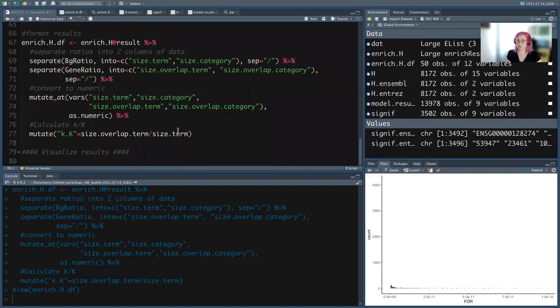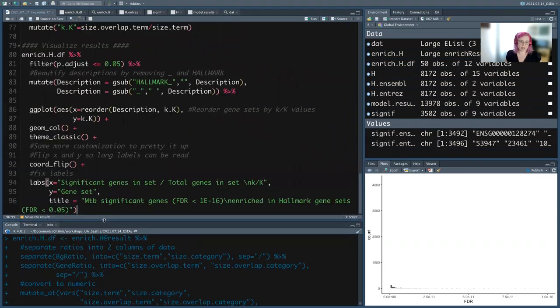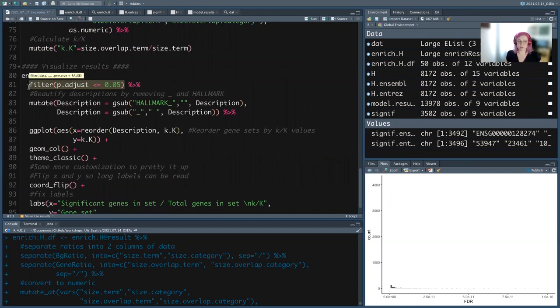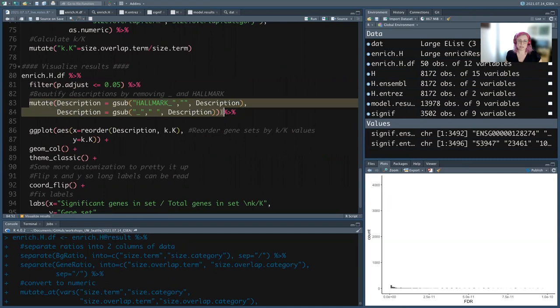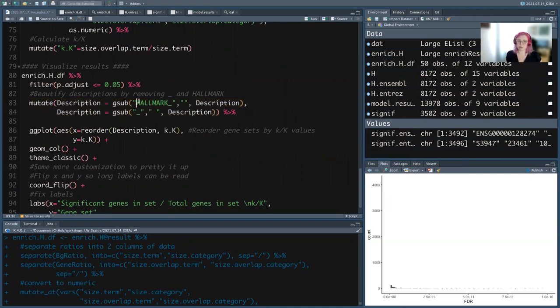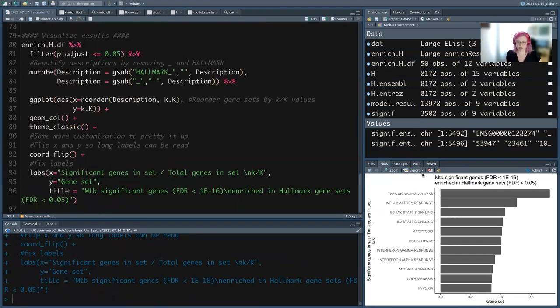We calculated K/K because that is the most common way to plot enrichment results — it's the relative measure of how many significant genes are in a gene set relative to how big that gene set is. I'm going to copy the plotting code from the notes since we covered ggplot already. We're going to look at things with FDR ≤ 0.05, do some renaming to remove the HALLMARK_ prefix and change underscores to spaces, and then plot K/K for each gene set description.